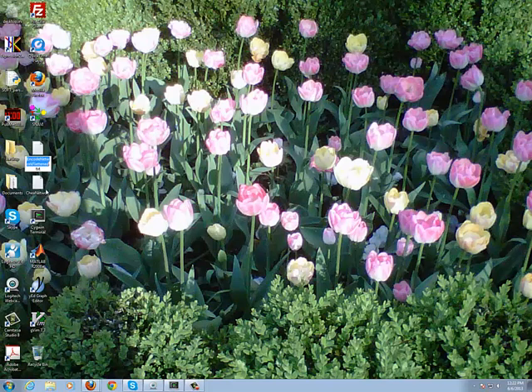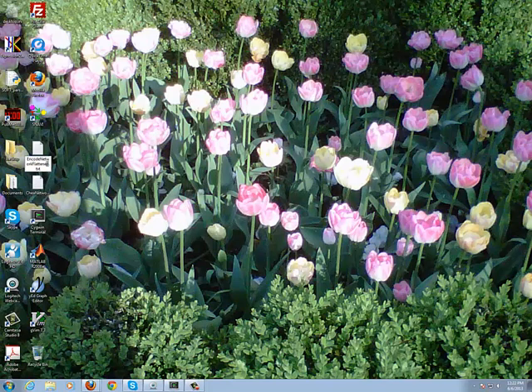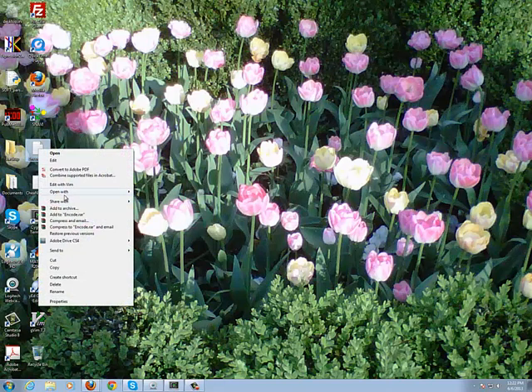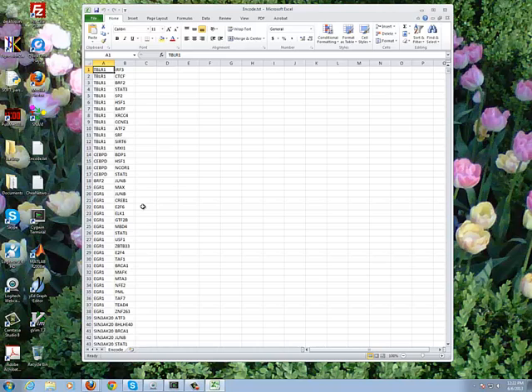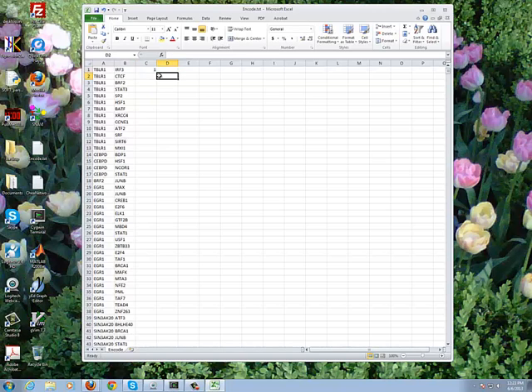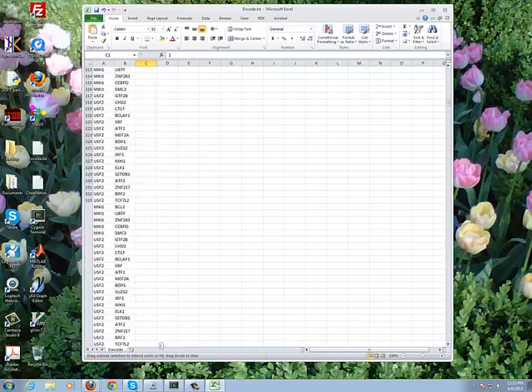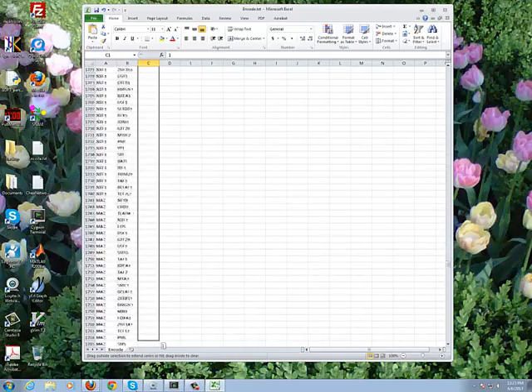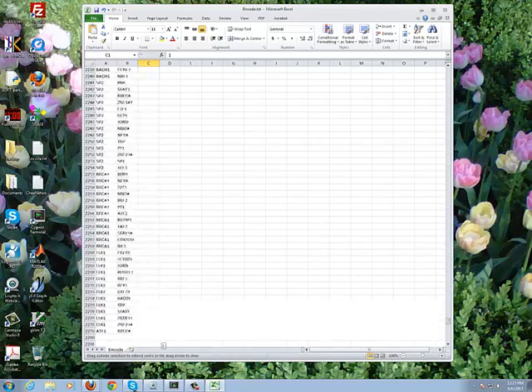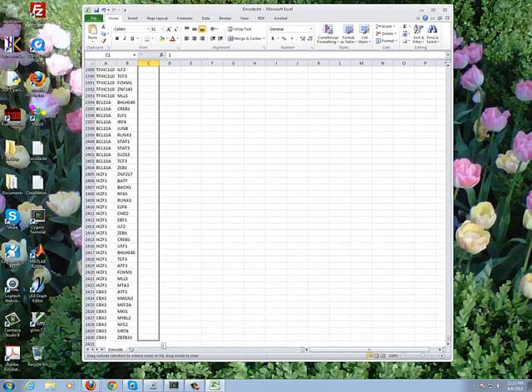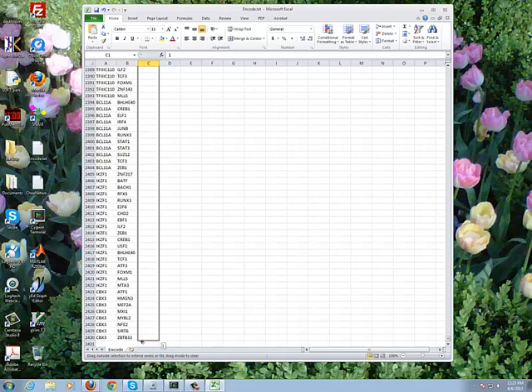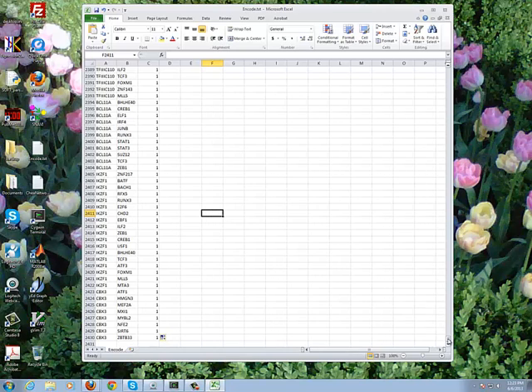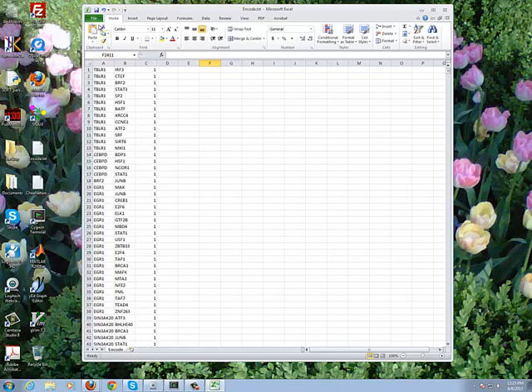So first I'm going to rename this network to encode, so I don't have to type a long thing. And then I'm going to open this with Excel. I'm going to put a 1.0 as a number and I'm going to copy it for all of the interactions. Because the script takes three column networks.